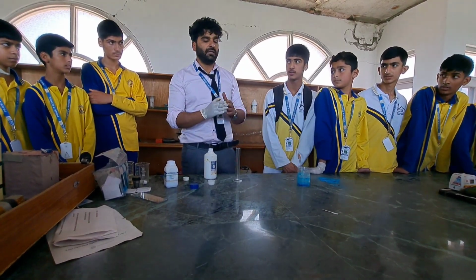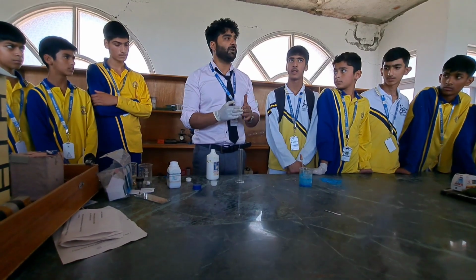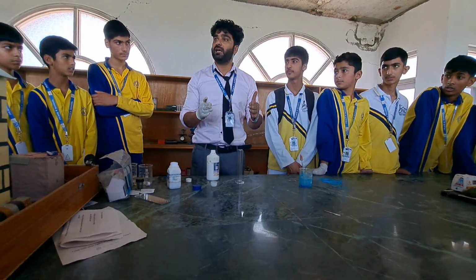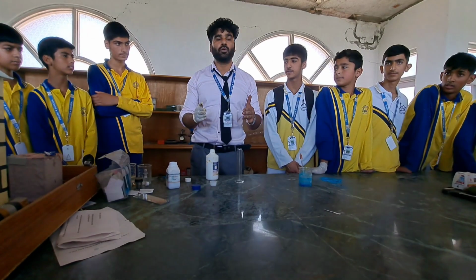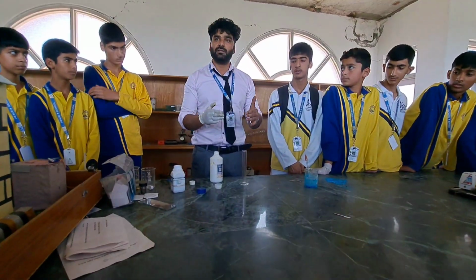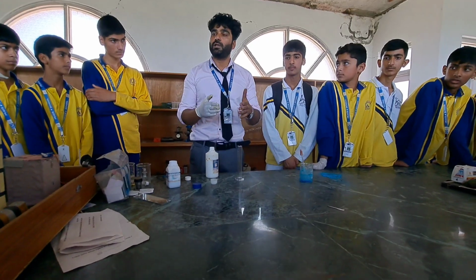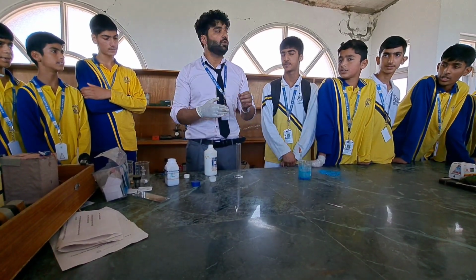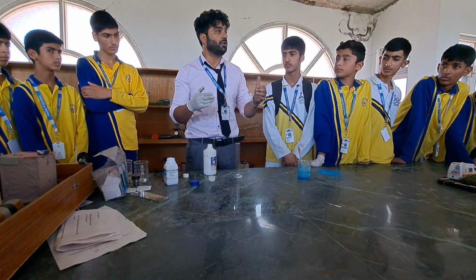Yes, sir. When metals react with acids, what is the product? What product is formed there? Salt. And which gas? Hydrogen gas. Okay. Can I ask you a second question? Yes, sir. When sulfuric acid reacts with zinc metal, what are the products? Zinc sulfate plus hydrogen gas. Do you know that this kind of reaction is an exothermic reaction?